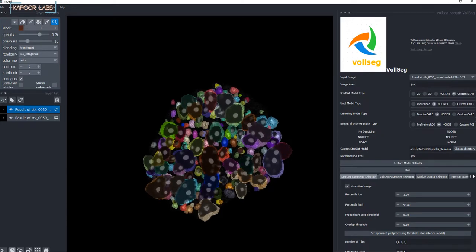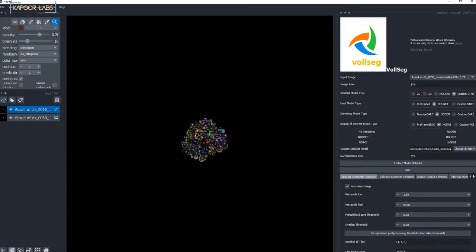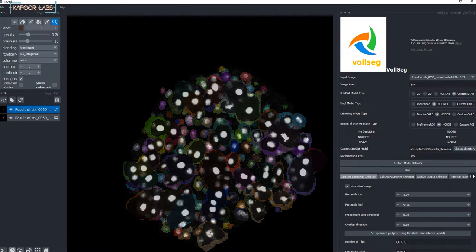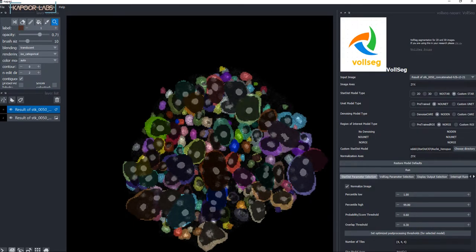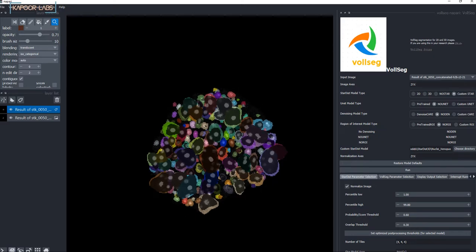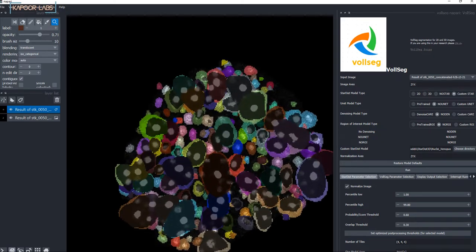cells. It looks like really bad segmentation for these cells, because it seems like there's hardly any match between the cells and the segmentation that you get for these cells, and it's because of the normalization issue. Here, the cells were present only in a very small region, so the region of interest was just around here, but a lot of black pixels were included in the normalization step, so that spoils the segmentation of these early time points.